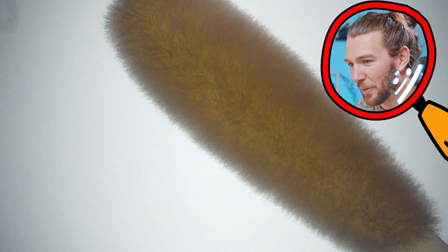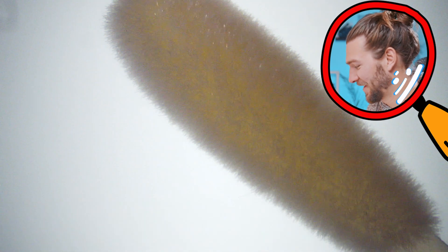Okay, so let's put this one here. I guess everyone will also be wondering what brand this is: Flow Q Swab. So let's see what it is. You can see here the fibers again much more clearly. Let's move it to the middle here. Yeah, it's super dense.